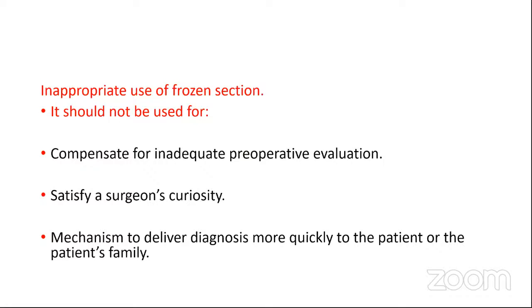The other inappropriate use of frozen section is to satisfy surgeons' curiosity. And one more thing is it's sometimes used as a mechanism to deliver diagnosis more quickly to the patient or to the patient's family and tell them the diagnosis is benign or malignant. We encourage our colleagues to just wait until we get the final answer from the permanent sections that will give us the best answer and best subcategorization and subtyping of the malignancy.